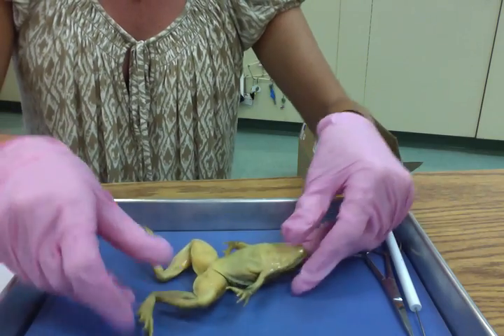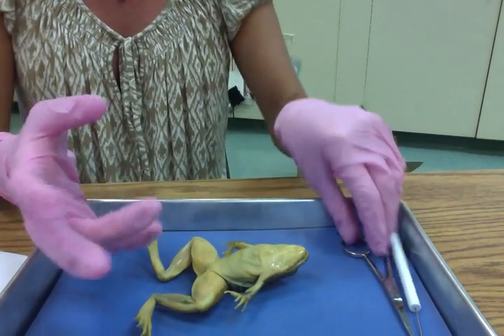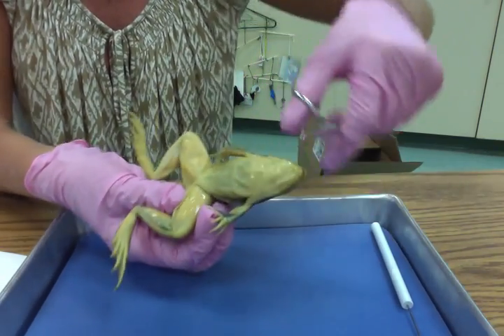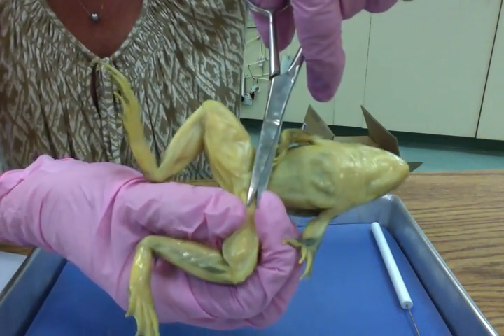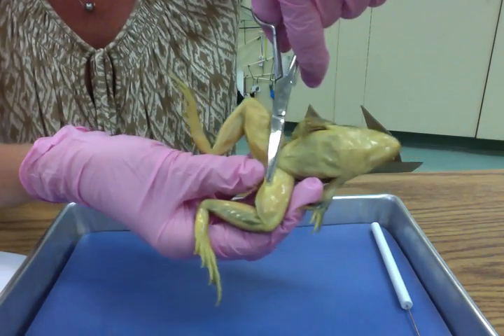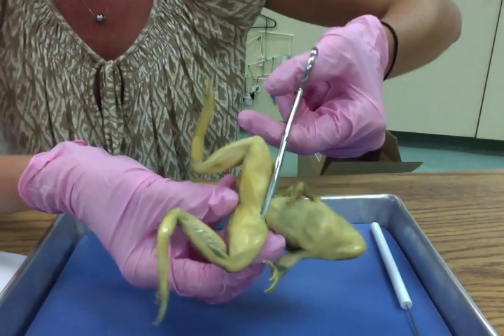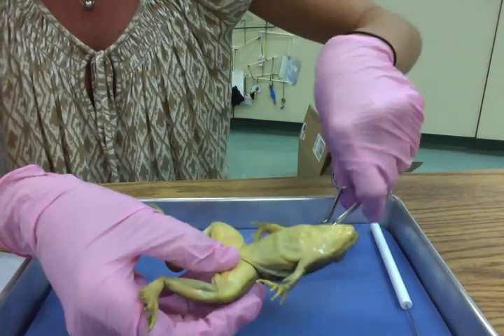Next, we're going to turn the frog so that the ventral or bottom side is up. Here we're going to make our first incision. You'll see on your frog how thin the skin is. We're just going to make a small slit right in the groin area. And you'll see that it's really easy to get the scissors under the skin there. So we're just going to make a slit down.